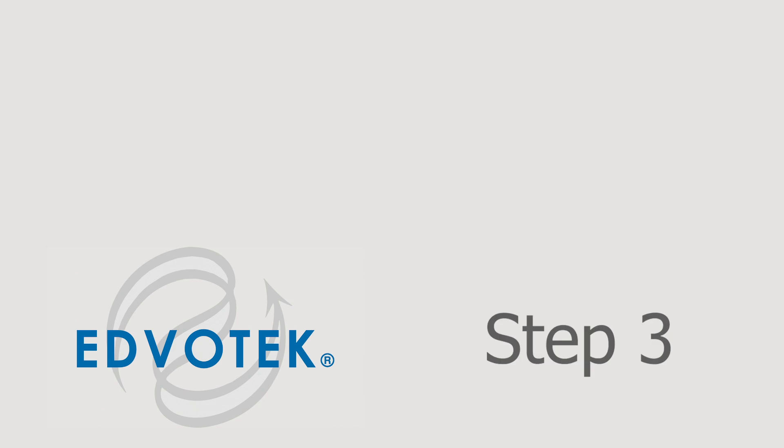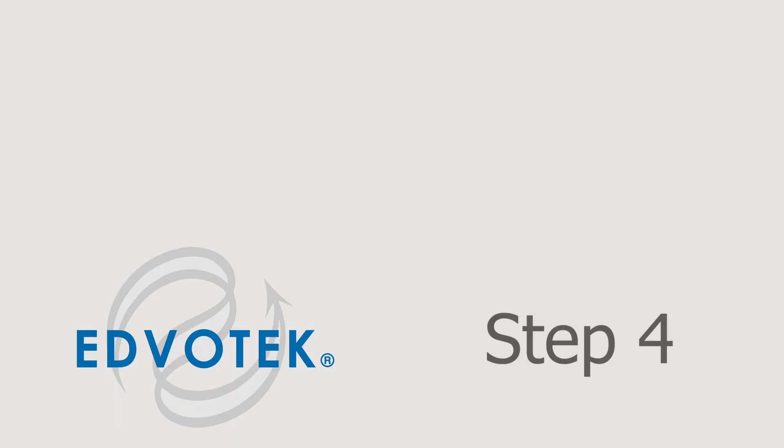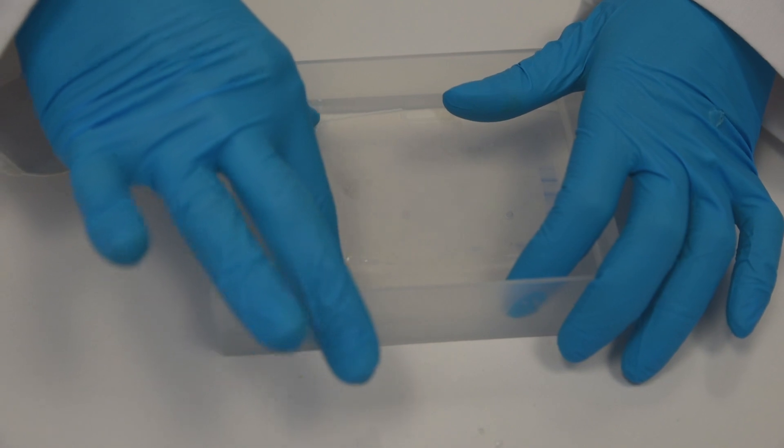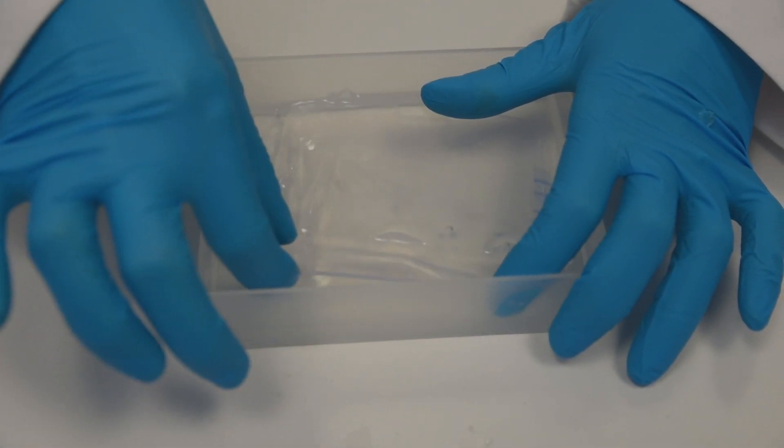Step 3: Add approximately 100 ml of the staining-destaining solution to the tray containing the gel and back plate. Use enough solution to just cover the gel. Step 4: Carefully remove the back plate from the tray, leaving just the gel in the staining solution.